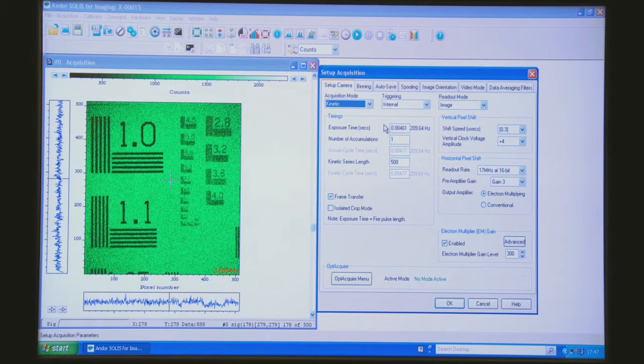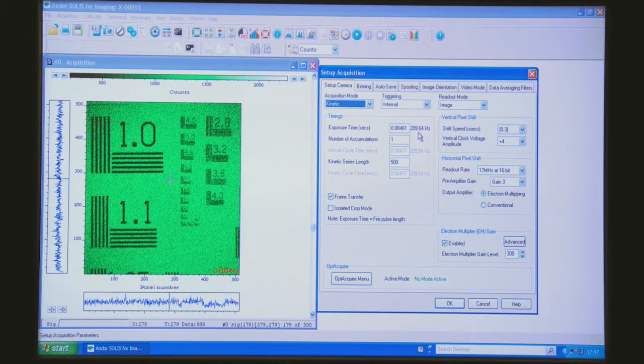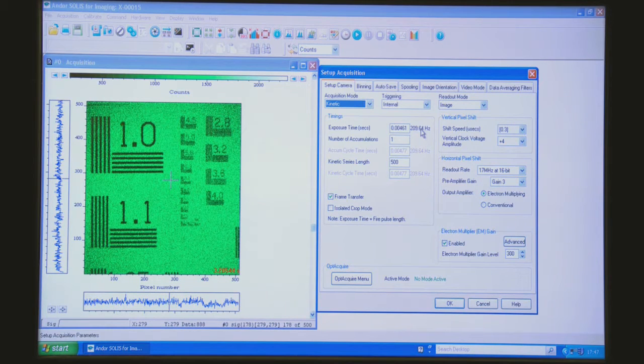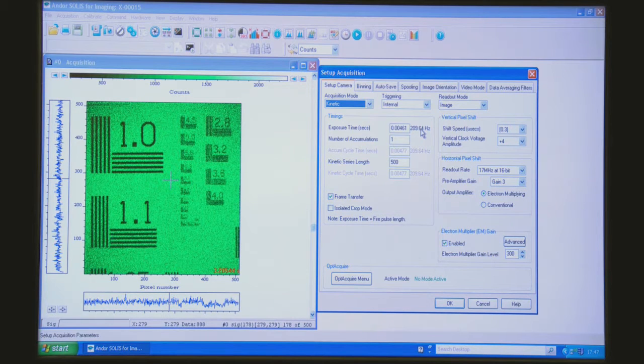If we go back you can see the frame rate has already increased to about 209 frames per second because we're only reading out a smaller section of the chip and throwing the rest of the pixels away.